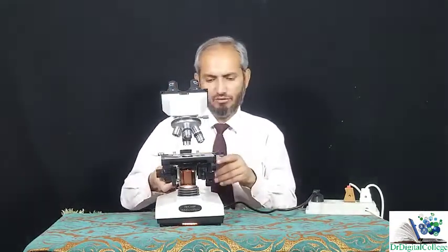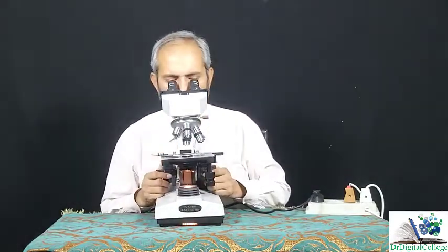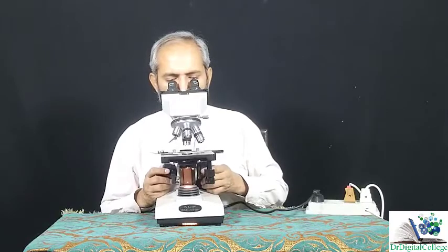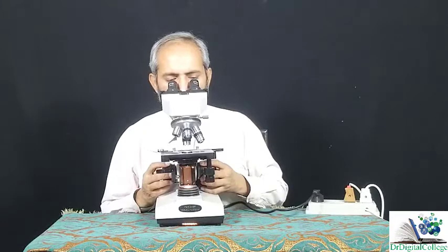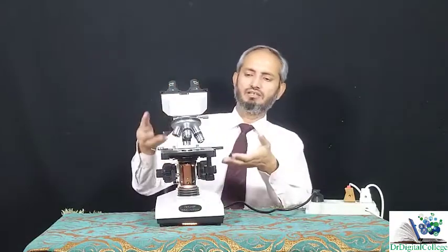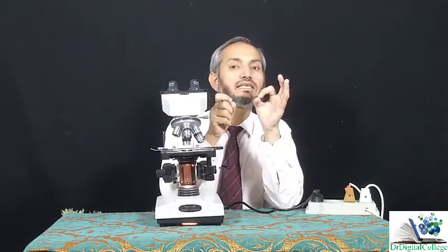First of all, right now my stage is locked and I have unlocked it. Now it will be moving up, and I am slightly moving up and up and up. A time has come just now when, as the stage was moving up, some dust particles were observable. It means that something on the slide can be seen now.